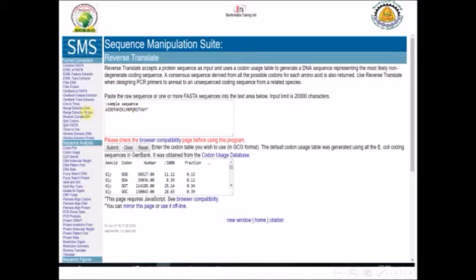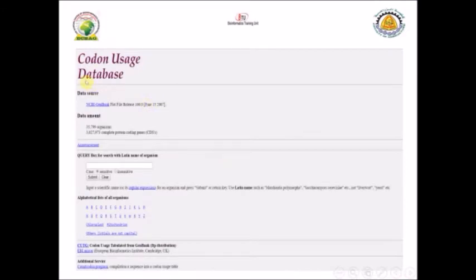If you would like to change the codon table, you can click on the codon usage database and pick whatever codon usage table you'd like to use — for example from any organism. You can use Homo sapiens or any other organism. Just write the Latin name of the organism and it will pick up the codon table for that specific organism.